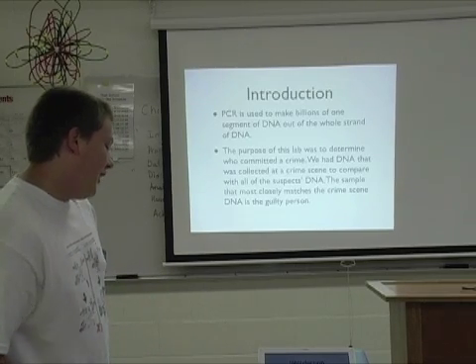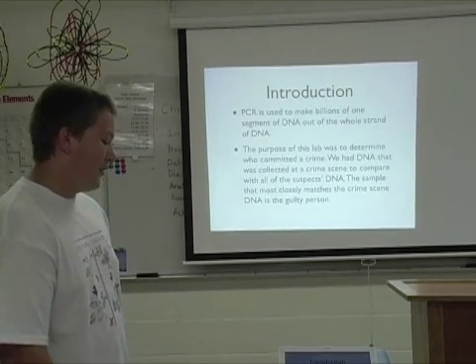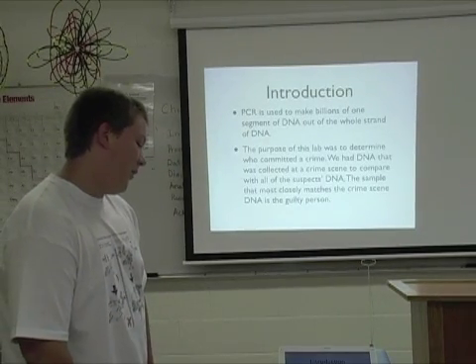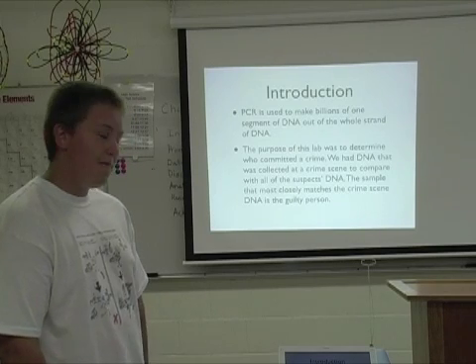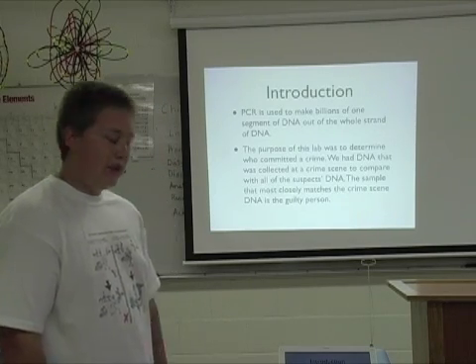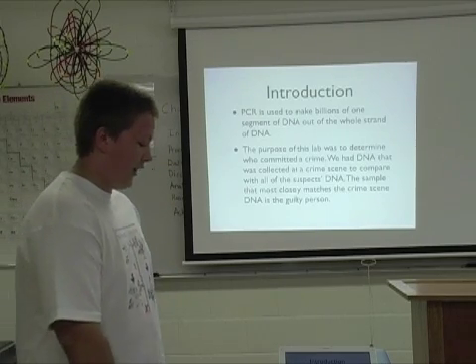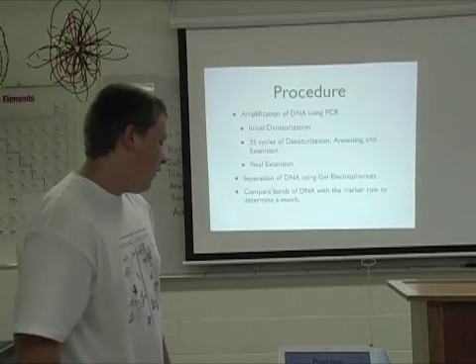And the purpose of this lab was to determine who committed a crime, and we had DNA that was collected at a crime scene to compare with all of the suspects' DNA, and the sample that most closely matches the crime scene DNA is the guilty person after we run it.